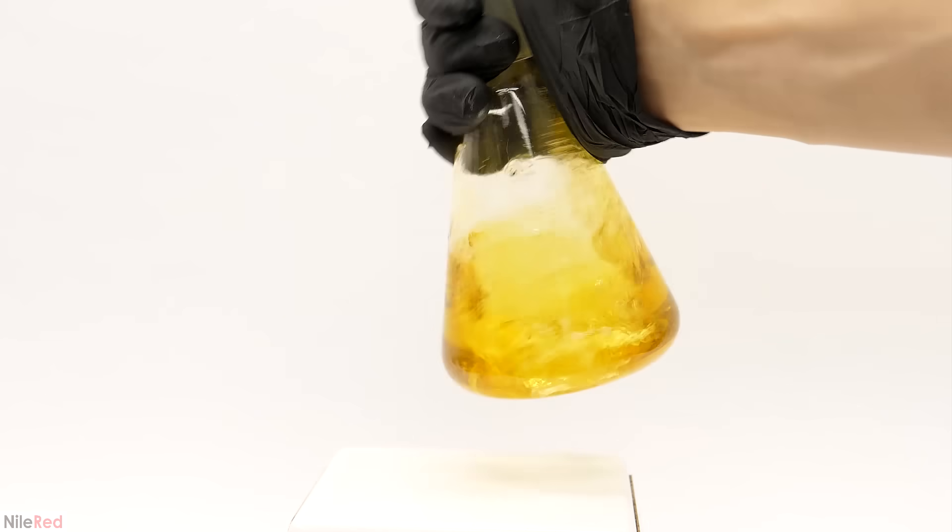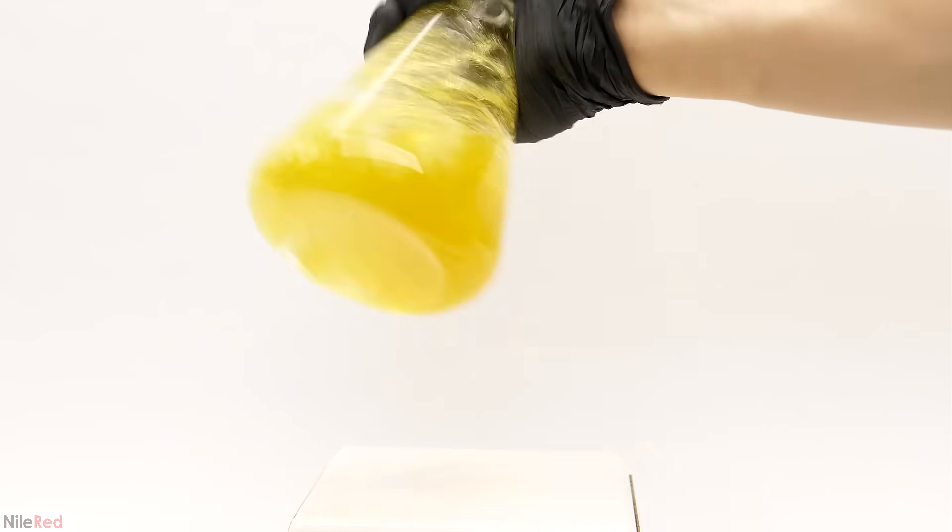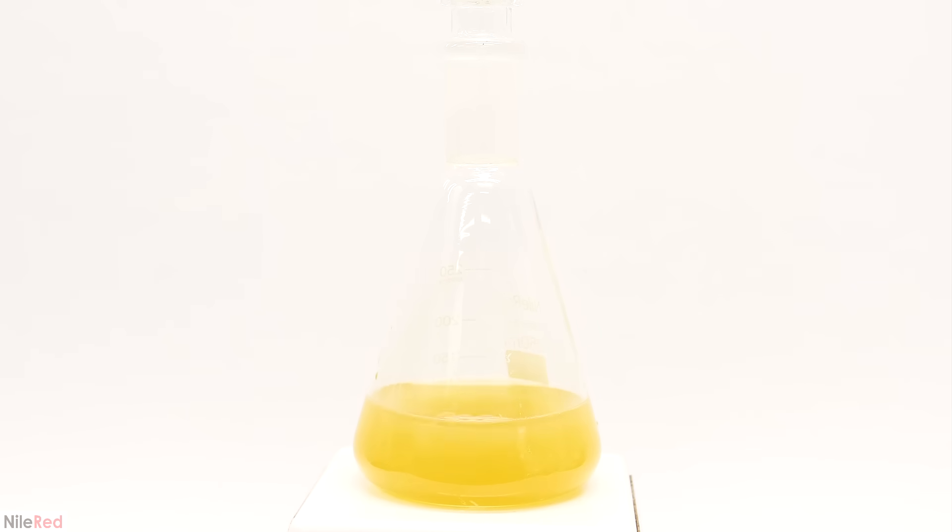If this were true then adding more base would shift more of it to the yellow form and it would ruin the color change. So to test this out I used a huge excess of the base and it did end up ruining it. This result definitely supports my theory but I think there needs to be a bit more work done to conclusively say anything.